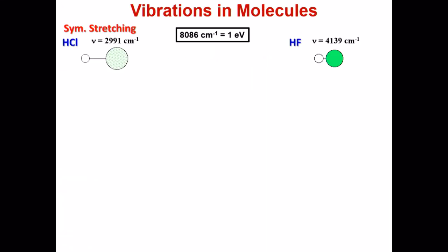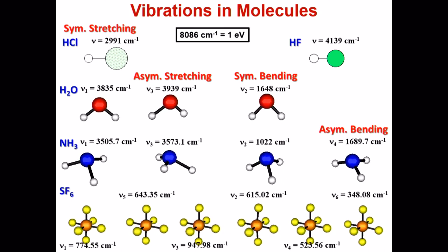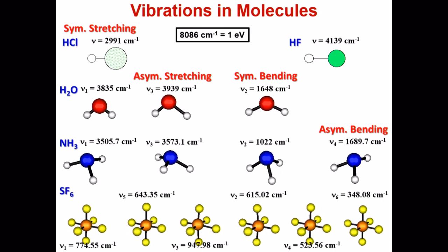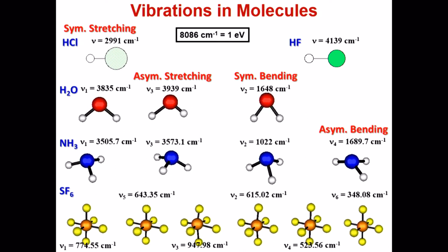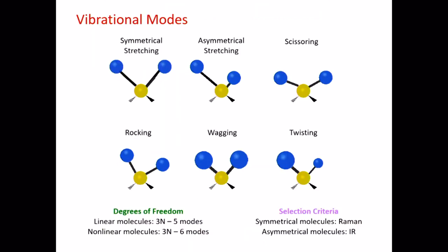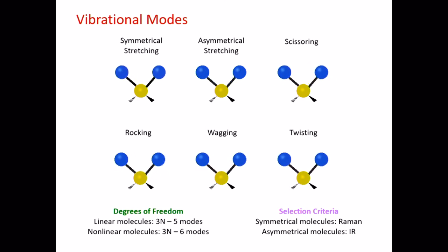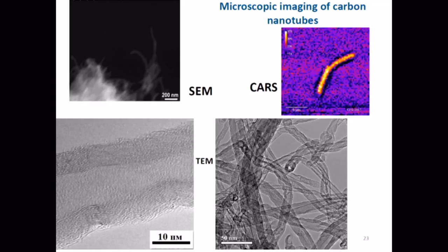We have the Raman at our center, wherein we can study whatever samples, solid samples, liquid samples, and different samples. So we can identify different modes of the material, and based on the different vibrational modes, we try to image it, and we also record the stability of materials. Symmetric or asymmetric, bending, wagging, twisting, rocking, everything we can see using a Raman spectra.